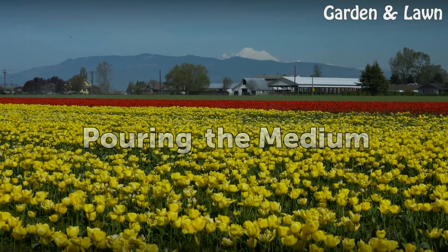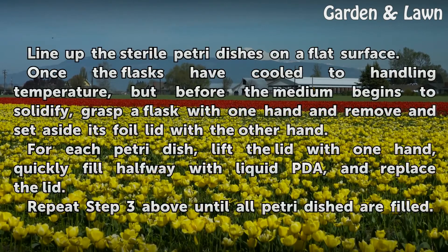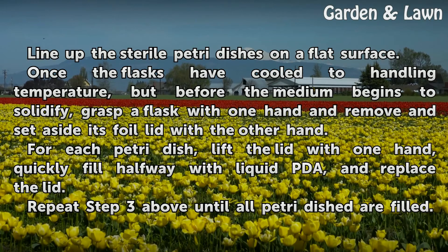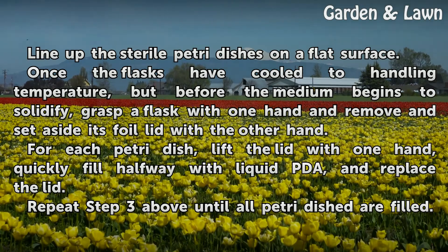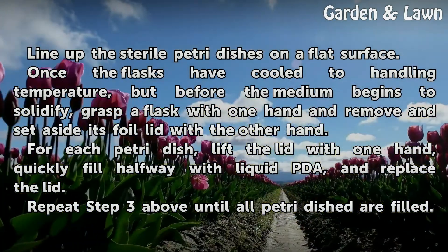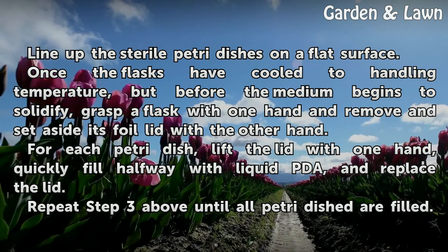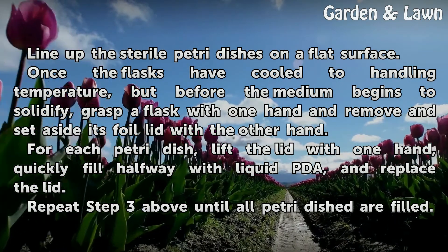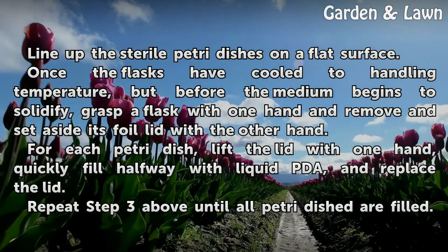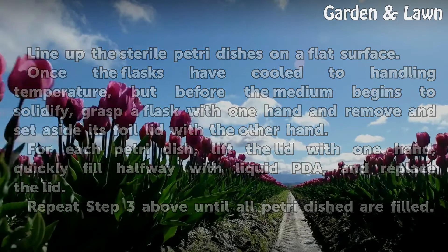Pouring the Medium. Line up the sterile petri dishes on a flat surface. Once the flasks have cooled to handling temperature, but before the medium begins to solidify, grasp a flask with one hand and remove and set aside its foil lid with the other hand. For each petri dish, lift the lid with one hand, quickly fill halfway with liquid PDA, and replace the lid. Repeat until all petri dishes are filled.